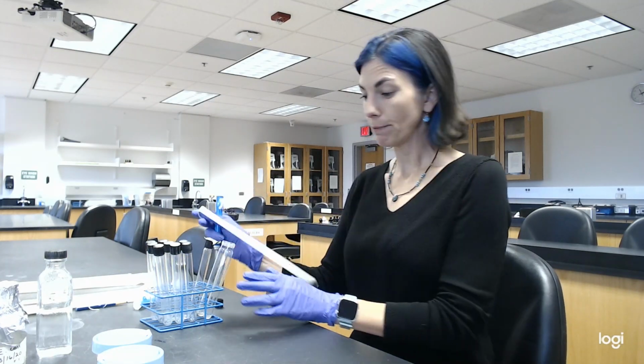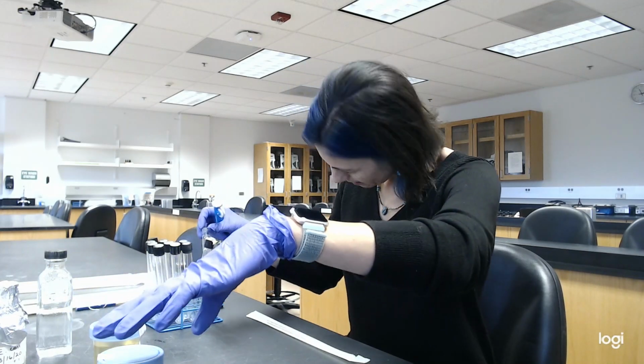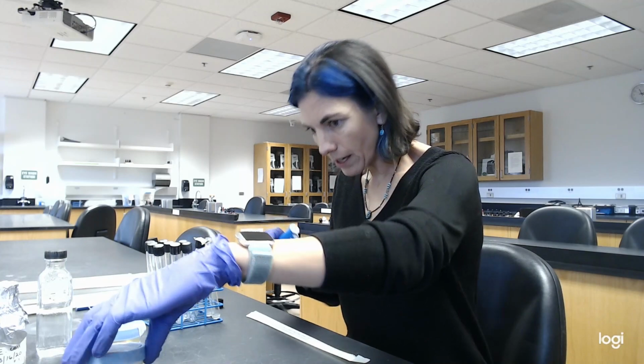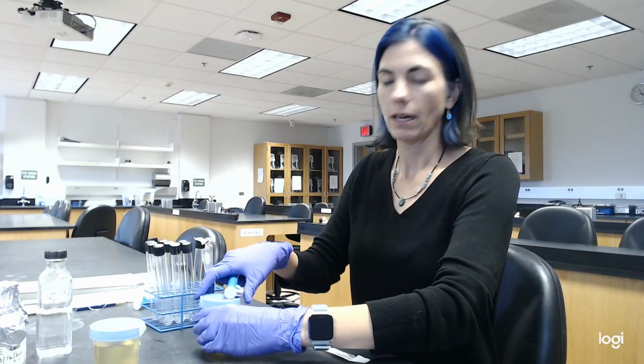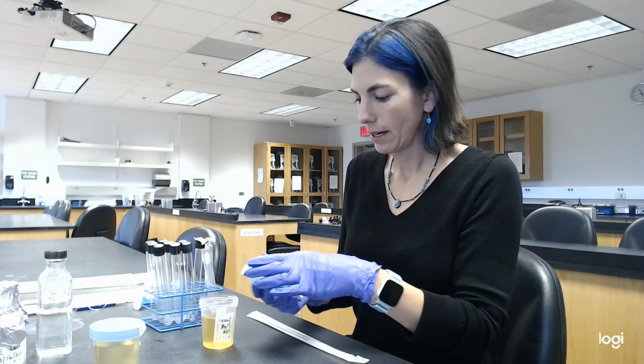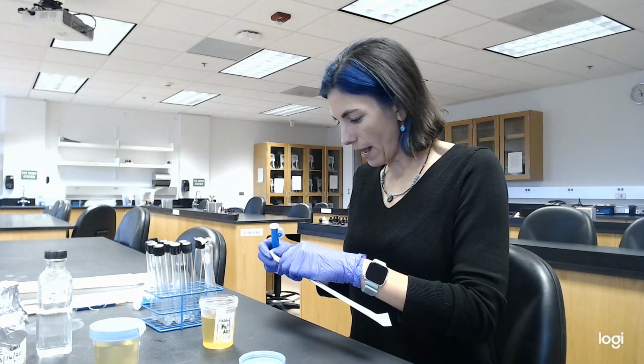So we change our tips to prevent cross-contamination. And let's see. Okay, so this is my urine sample prior to ingesting any Azo tabs.